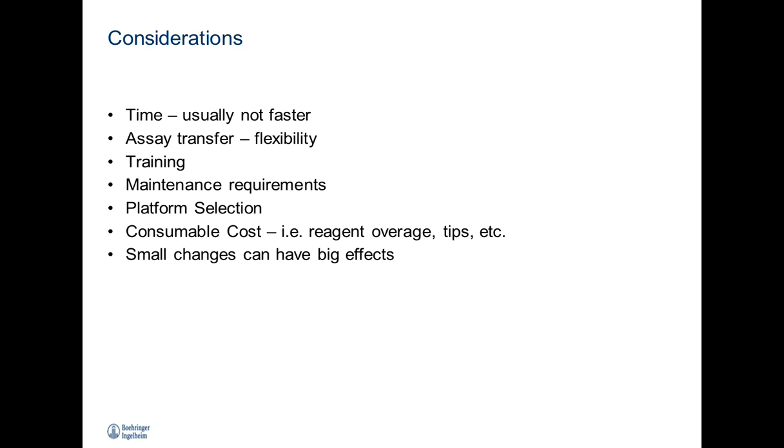Maintenance requirements are also something that a lot of people overlook. Service contracts have a cost. They also have a significant benefit, especially if you have critical equipment. Running a screening lab, we have several pieces of equipment here that we would consider critical, and we have service contracts on them that provide us 24-hour response time. Because if those pieces of equipment go down for any length of time, our workflow stops.